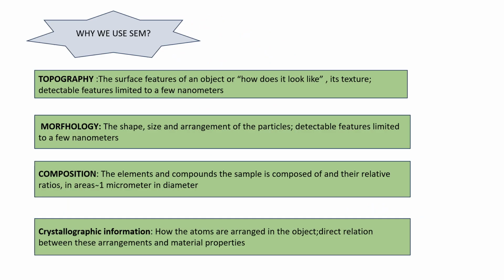So let's start. The first question is why we use SEM? What does SEM do? SEM gives the topographic, morphology, composition and crystallographic information of the specimen. Let's discuss these four terms one by one.